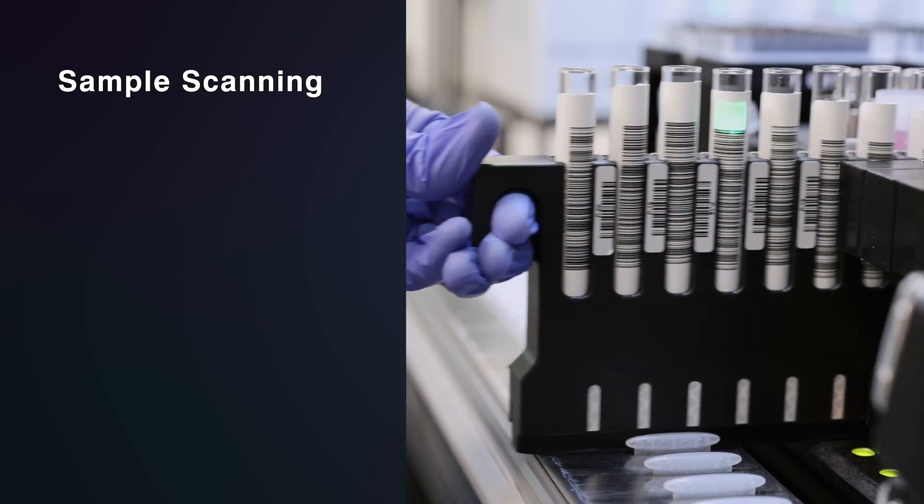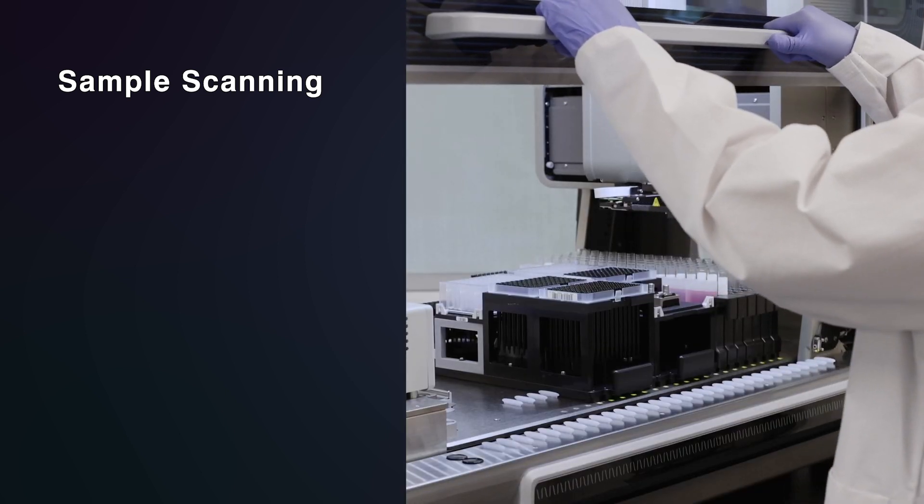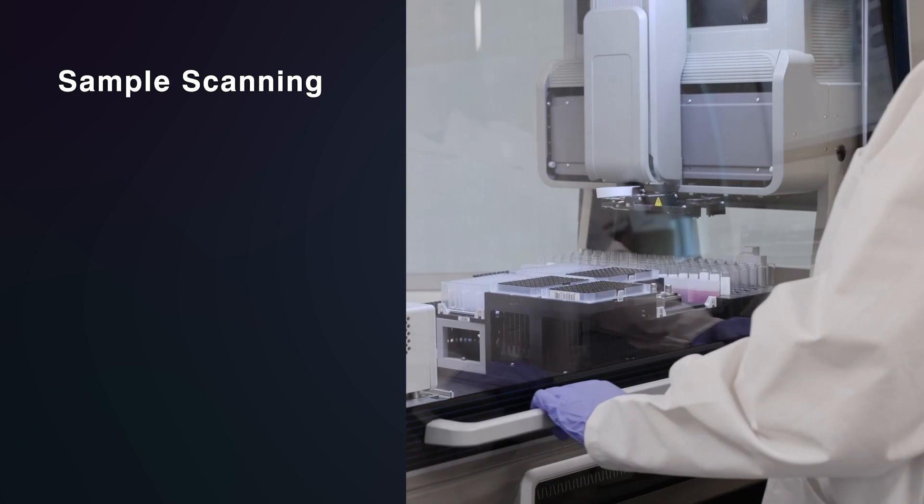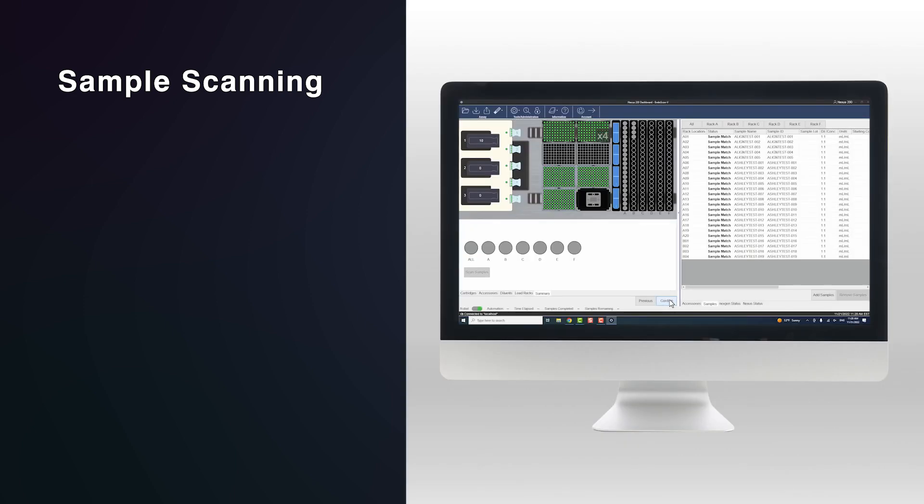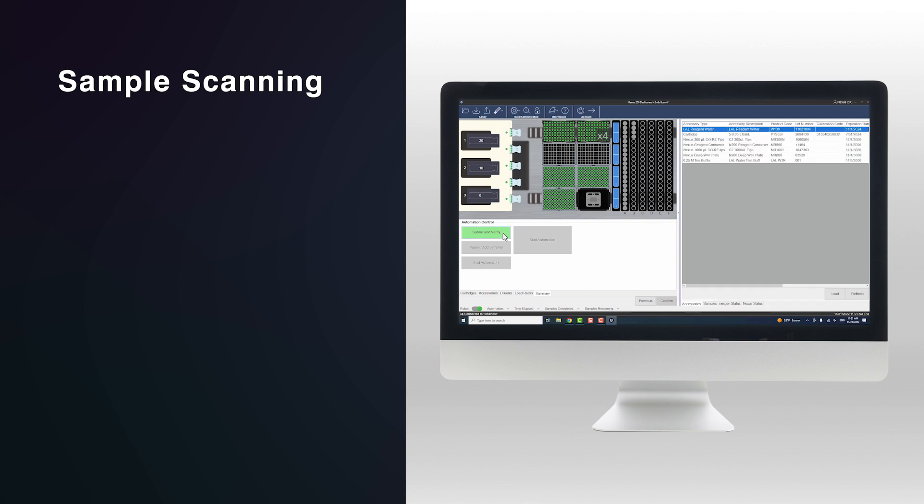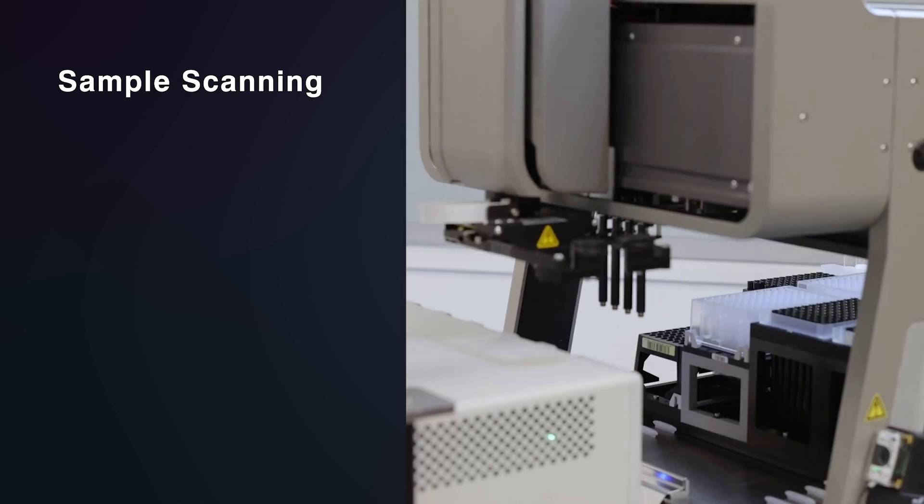Once complete, close the door to ensure the locking mechanism is engaged. This is a safety measure to eliminate access to moving parts during the operation. Submit and verify all the inputted information and then start the automation. The deck preparation is as simple as that for the run to be started.